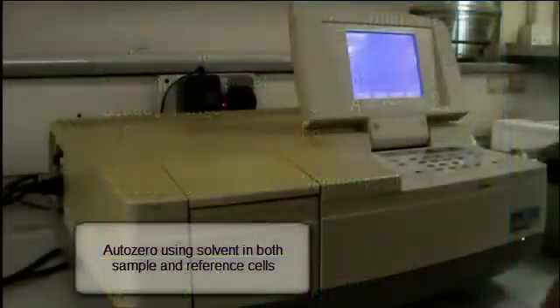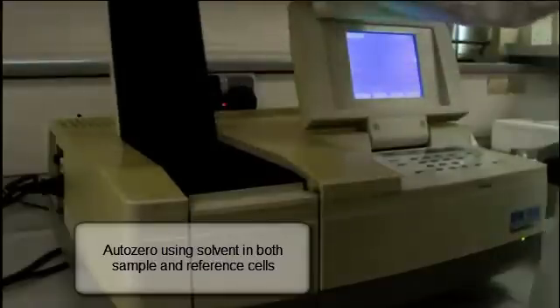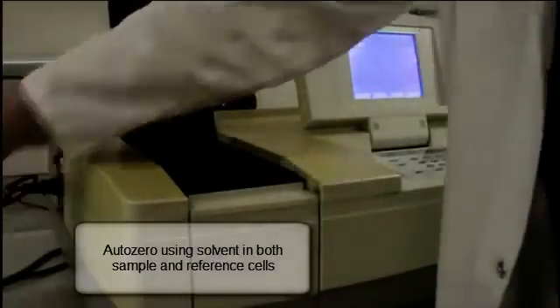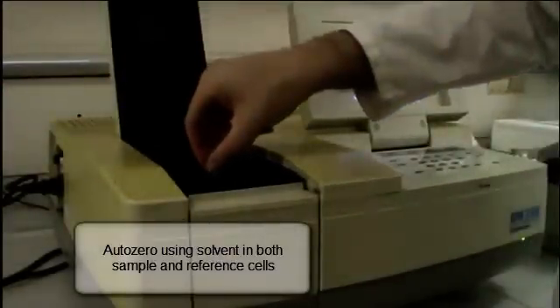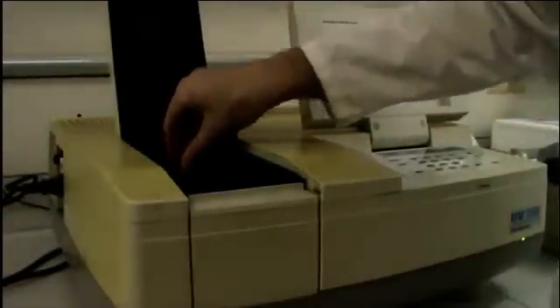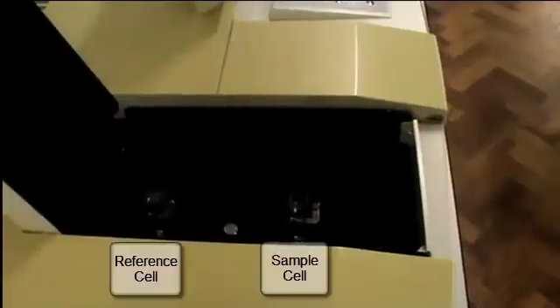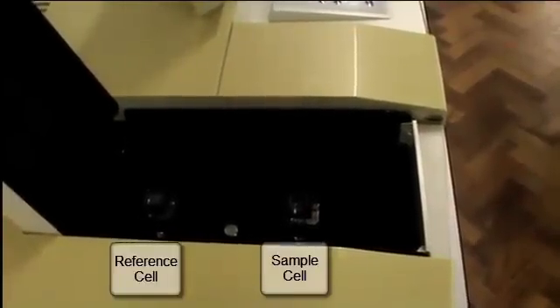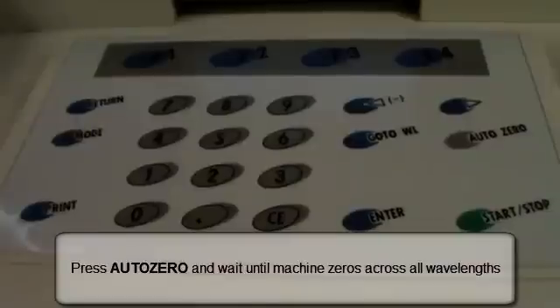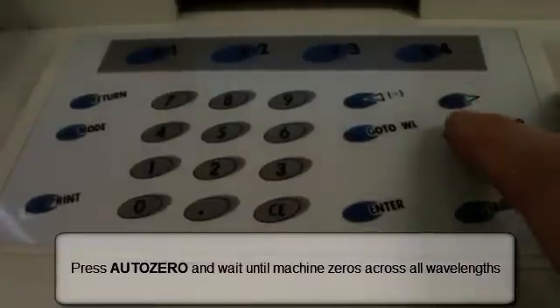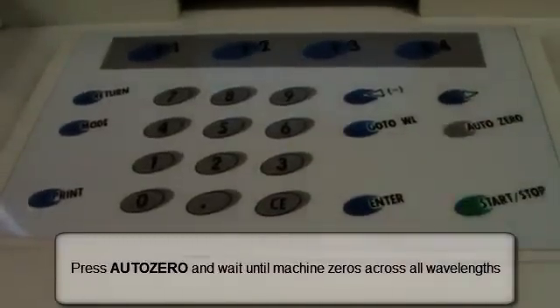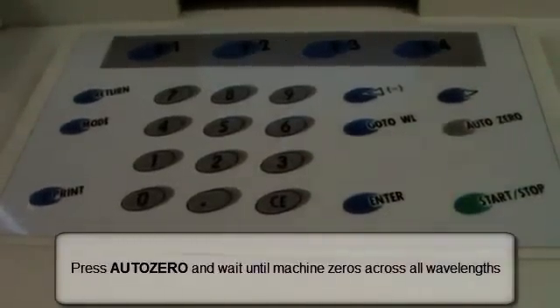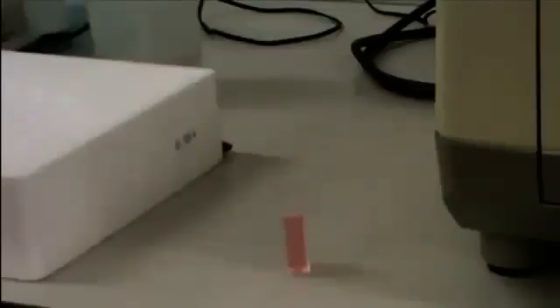Before acquiring a spectrum we need to zero the instrument to remove any absorbance due to solvent present. To do this we place solvent, in this case water, in both cells and put a cell in each of the reference and sample compartments at the back and front of the instrument. Make sure to align the clear side of the cell with the UV beam which is parallel to the front of the lab bench. The sample cell is always at the front of the instrument. Press auto 0 to zero the instrument.